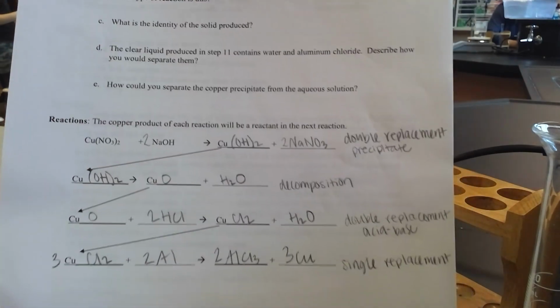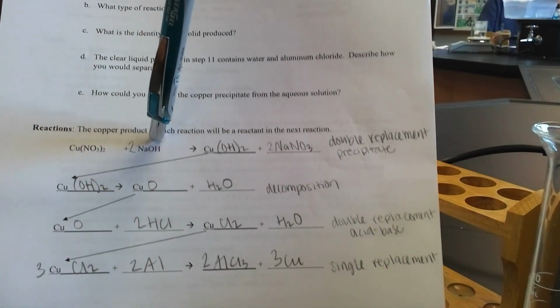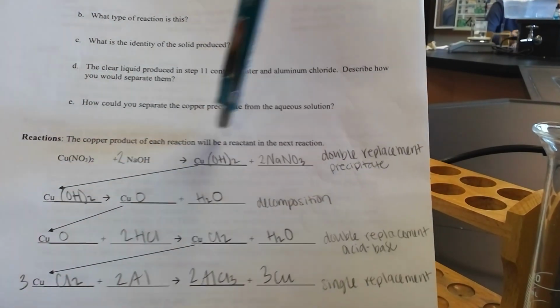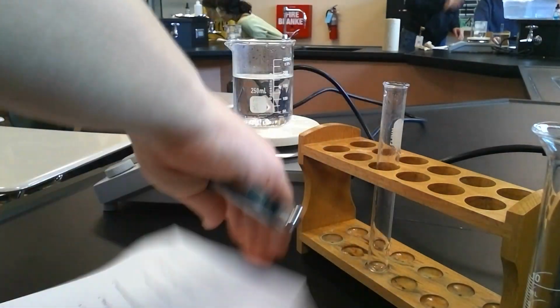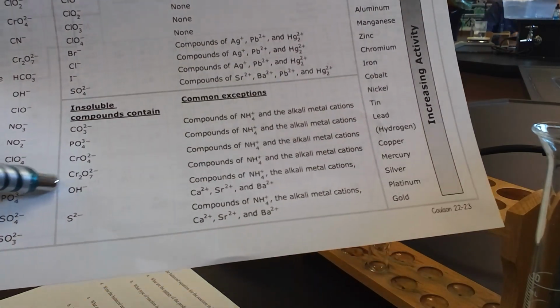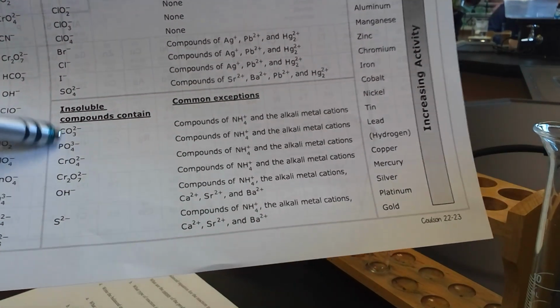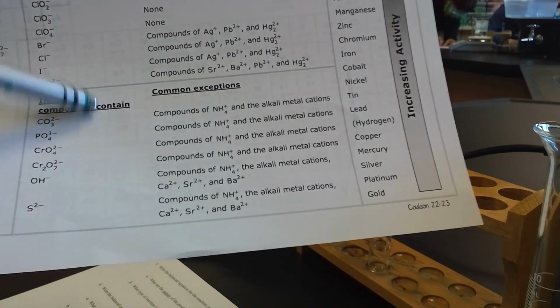I wanted to start with the first reaction, copper 2 nitrate reacting with sodium hydroxide. You form copper 2 hydroxide and sodium nitrate. I wanted to talk about how to determine what your precipitate is in this reaction. Using the back of your periodic table, we have our solubility chart, and the first product that we formed was copper 2 hydroxide. If I look up hydroxide on this solubility chart, it is in the section that says insoluble, which means that hydroxide is usually going to be part of my precipitate.